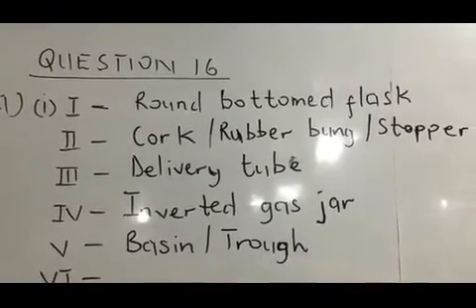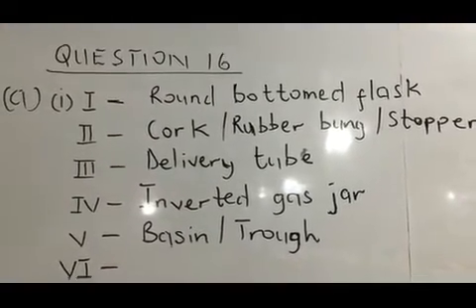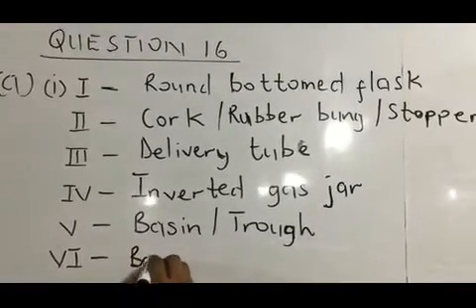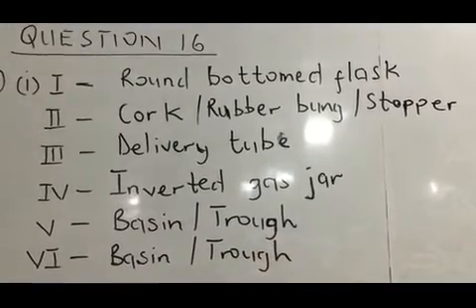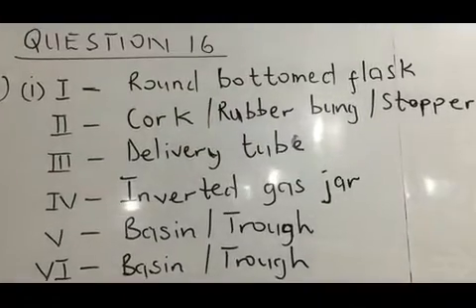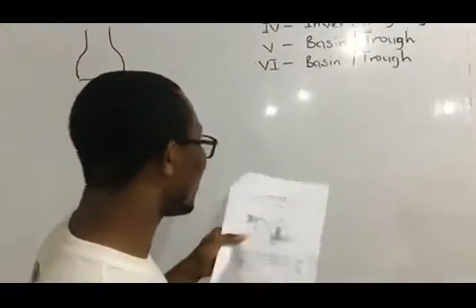But I'm sure the arrow should point to the beehive stand. In the right question, the arrow should be pointing to the beehive stand.